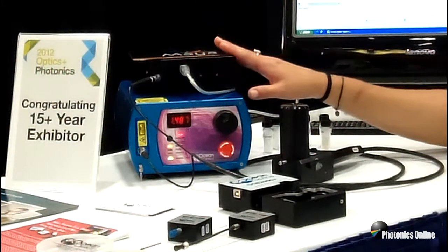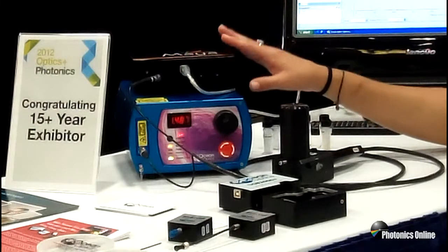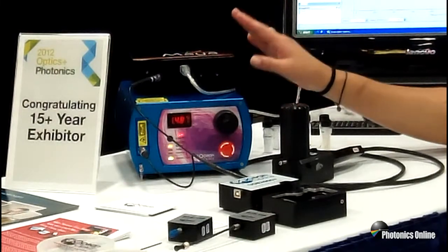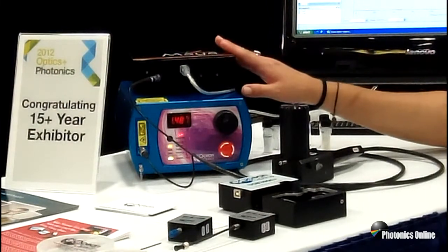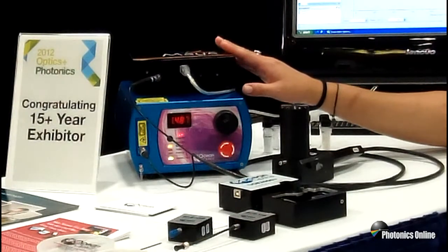We are actually able to push this silicon detector past 1100 nanometers to about 1180. So we have a detector in here with improved NIR responsivity, along with a grating that has improved NIR sensitivity.